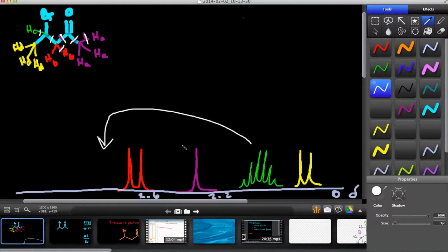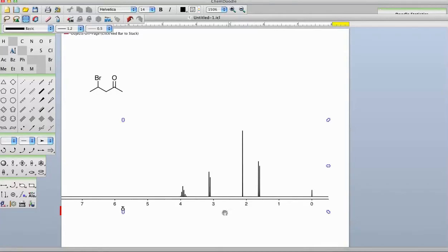Again, the chemical shift is the least important of all of the factors to consider because you got competing effects. Is it going to be more deshielded when it's close to bromine or more deshielded when it's close to the carbonyl? The answer appears to be when it's closer to the bromine. That's not something I would have anticipated. Also, you got this hydrogen that is alpha to the bromine, but it's gamma to the carbonyl, so there's still an effect. So our predictions are validated by this theoretical NMR.